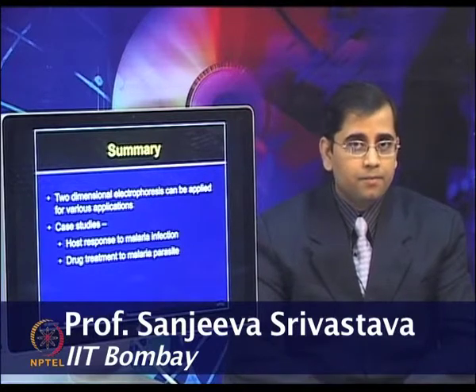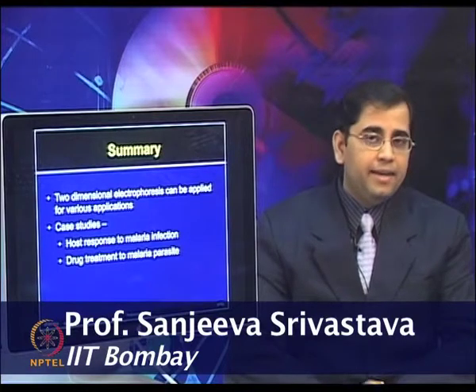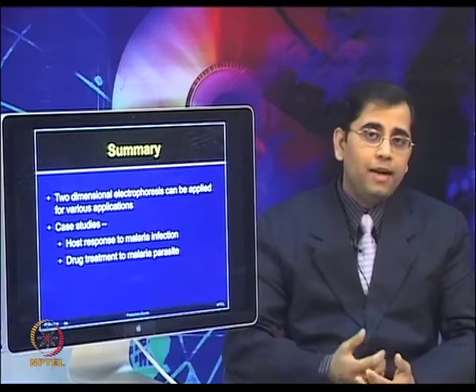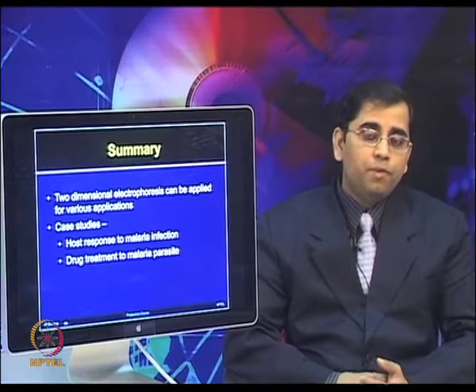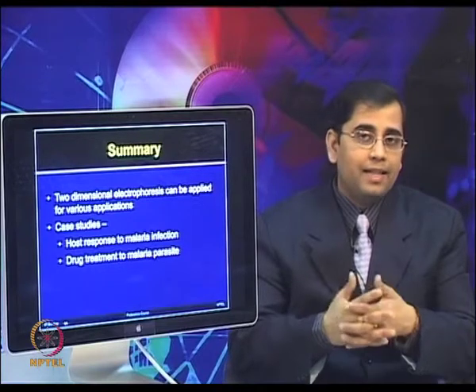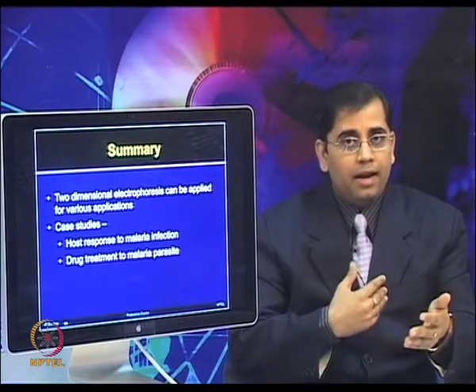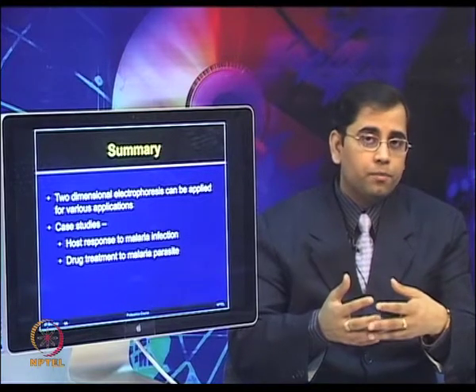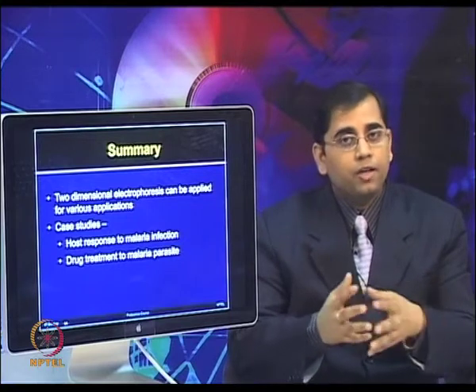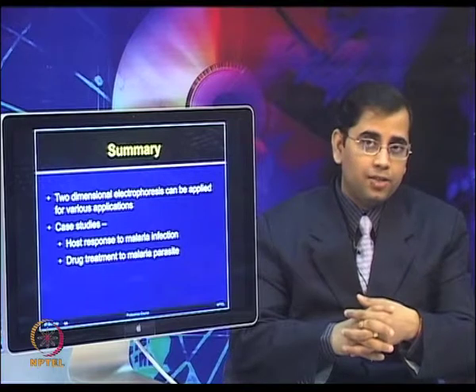the next class, but by giving you a case study and details of various types of experiments one needs to perform, probably you got an idea that before performing that final experiment on your case and the controls, a lot of optimization has to be performed, starting from your sample processing and how you can expand the coverage of the proteome. These types of quality control checks are very essential.